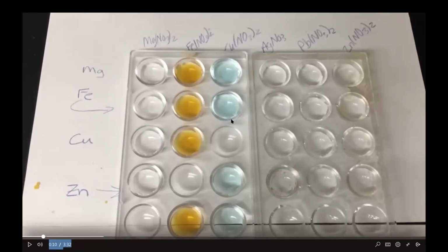This is on a white background because the iron nitrate starts out as like a brownish color. The copper nitrate starts out as a bluish color. So pay attention to the fact that those start out in those colors. All the other solutions, magnesium nitrate, silver nitrate, lead nitrate, zinc nitrate, those solutions are colorless to start.